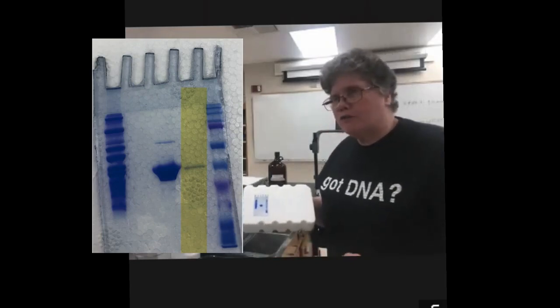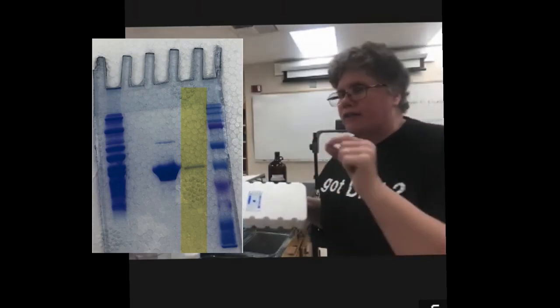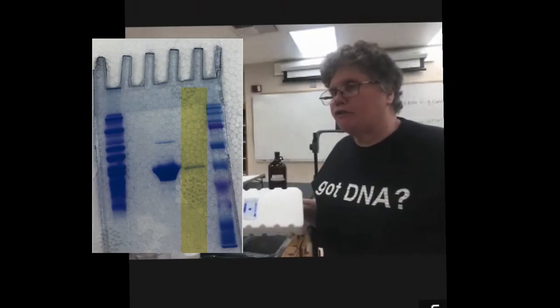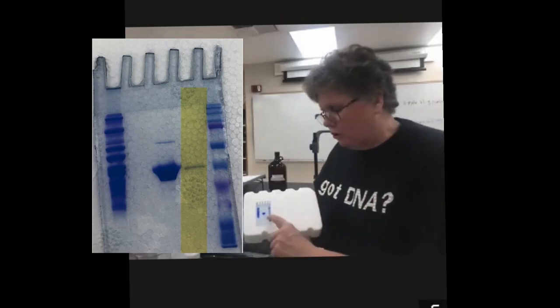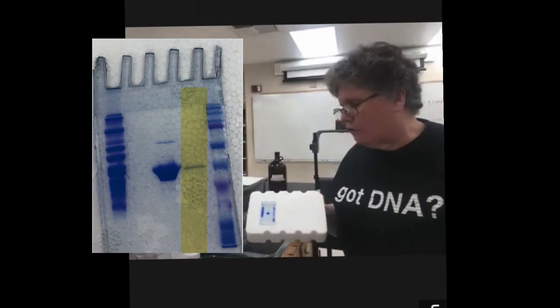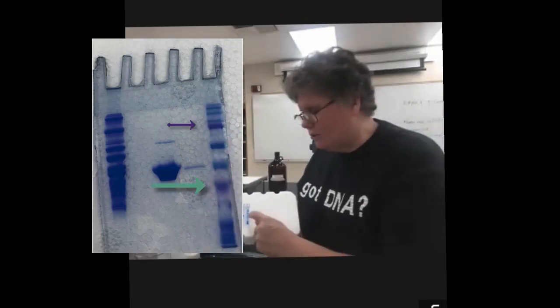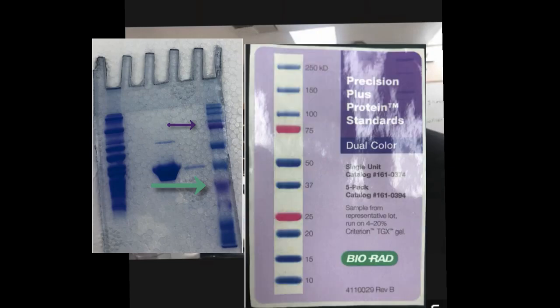We don't have very much S4 because I only took a small amount of all that 6 mils of S3. I only took a half mil out of that to put over the S4, and then that was in several fractions, so it's much, much more diluted. So basically, we only have a very small band of S4 right there, but the important thing is we have a very specifically sized band. You can then use the size markers to compare to the known sizes.